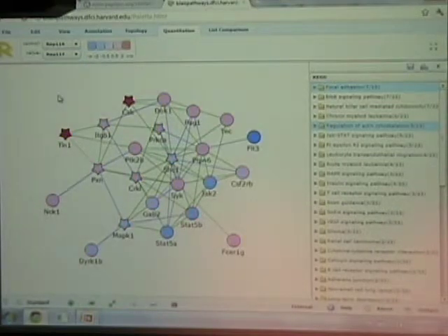So we can look now just at differences in the two constitutively active mutants and look at differences in the phosphosite patterns. Two things to note here. One, because of the level of the display, I have to average over all the phosphosites that are found in these proteins. Most of these have just one phosphosite in them, so this really is a one-to-one correspondence with the underlying phosphosite.